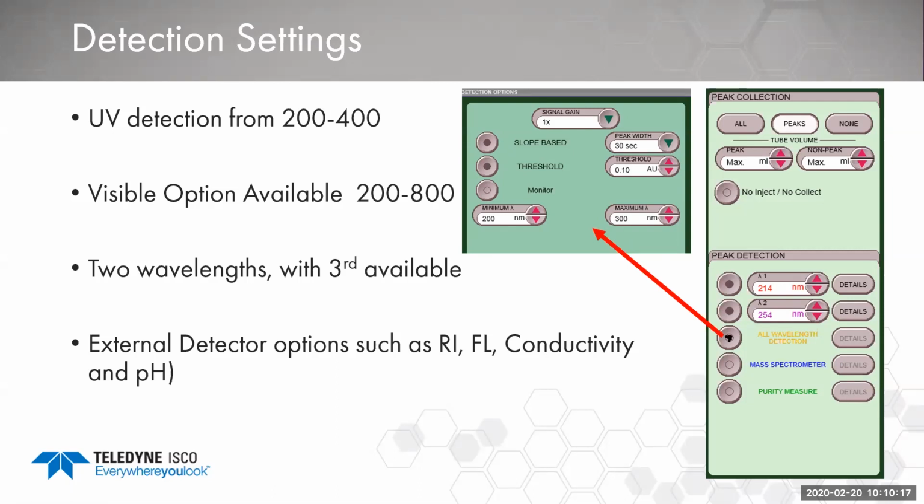Most people that do standard reverse phase chromatography are going to say, well, why do you need those? I particularly don't use them, but I know that there are some instruments out there and there are some bioprotein and peptide people who actually like to monitor that as a history issue. So we can always bring them in as an additional channel onto our systems if you need it to.